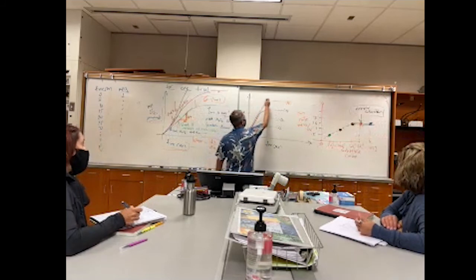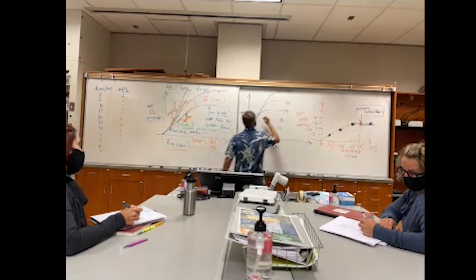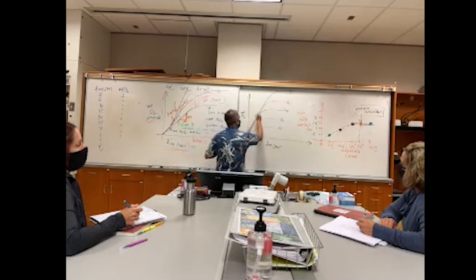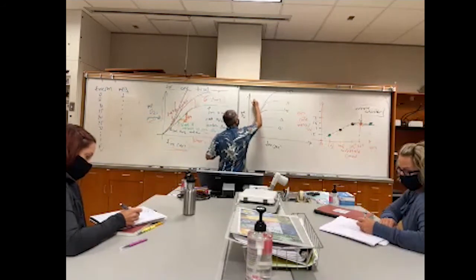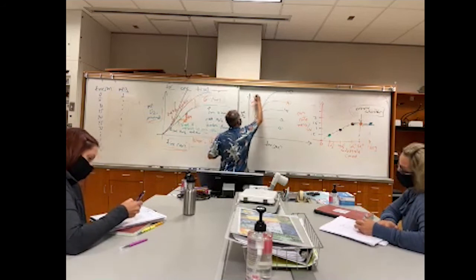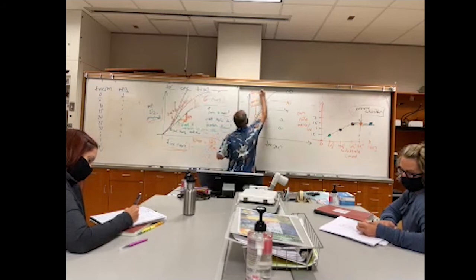The slope is the same, but it'll ultimately go for longer and make even more. So when you see same slope, this is an indication that we've hit enzyme saturation.